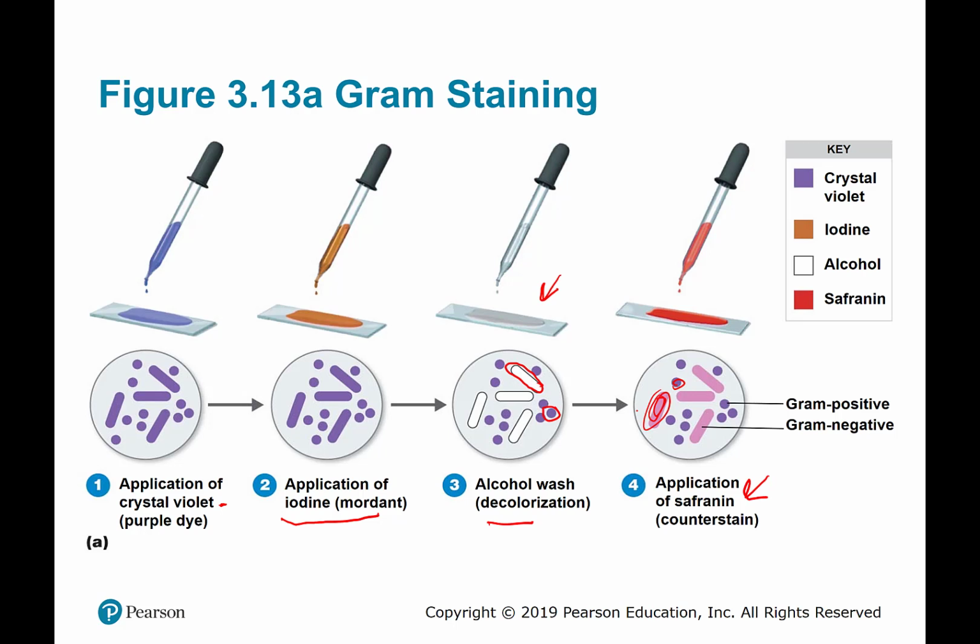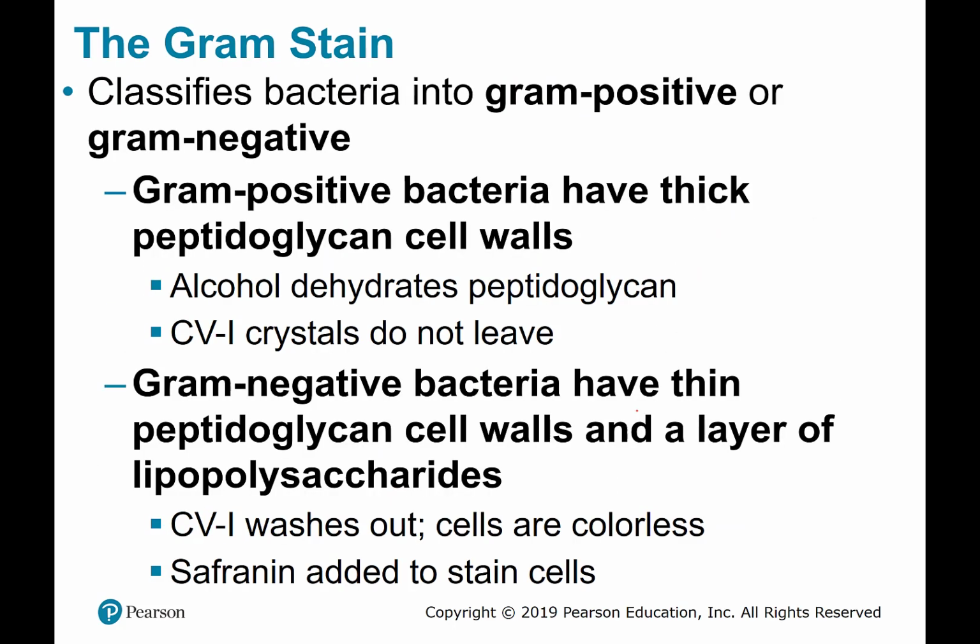And it is early in the semester. We haven't talked about cell wall structure. This will make more sense after we cover Chapter 4, and after you complete the laboratory as well, that will help you to understand the Gram staining technique. So the Gram stain is going to allow you to separate two major groups of bacteria, those that are Gram-positive from those that are Gram-negative. There's a large group of bacteria that have a particular cell wall structure. Those are Gram-positive organisms. Another major group of bacteria are the Gram-negative organisms, and they have a particular structure of cell wall.